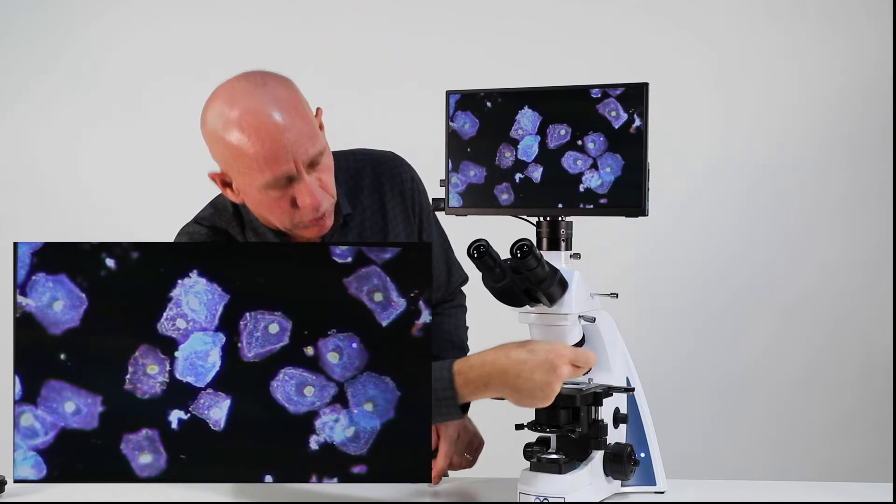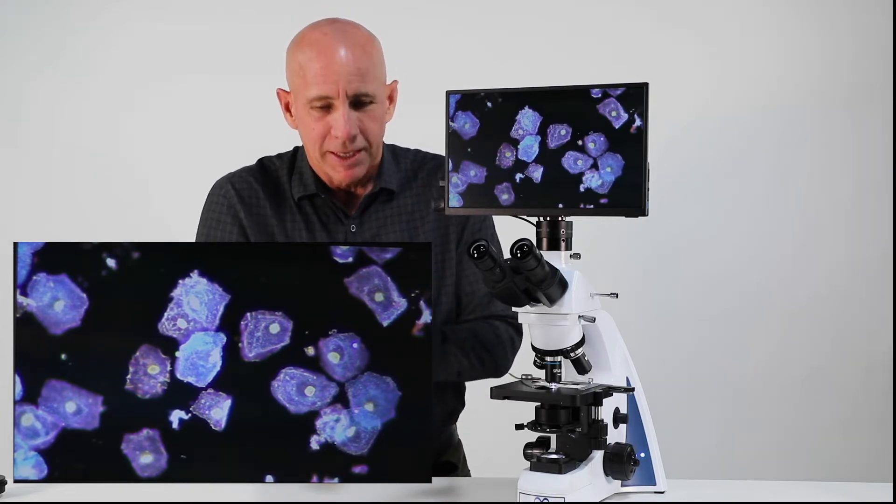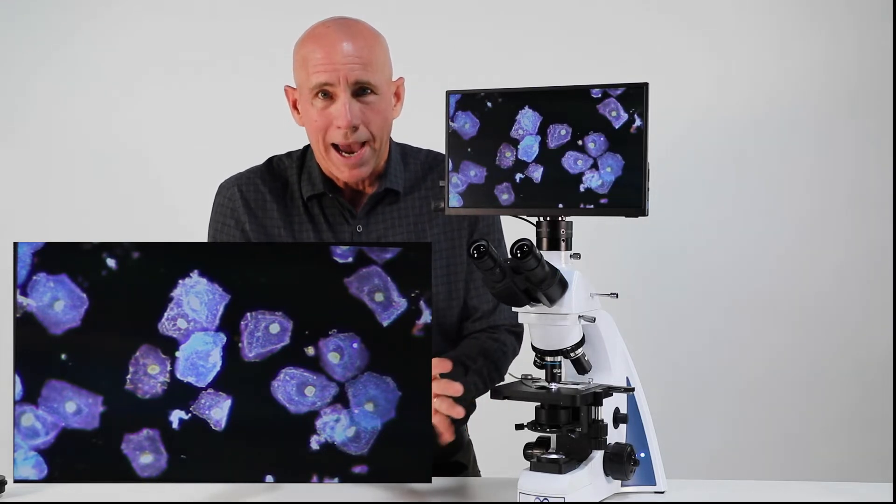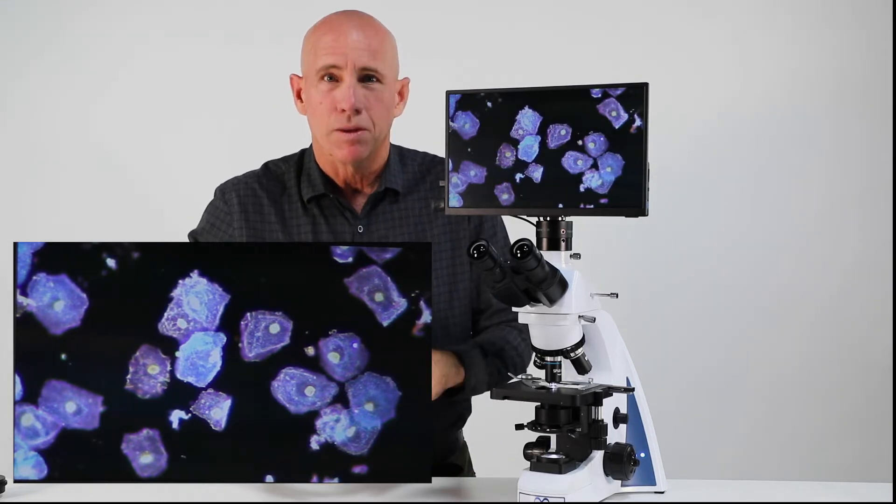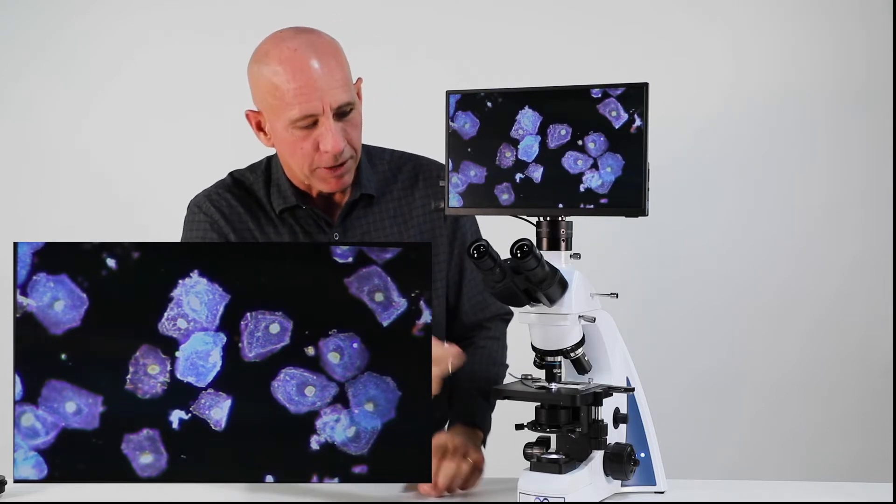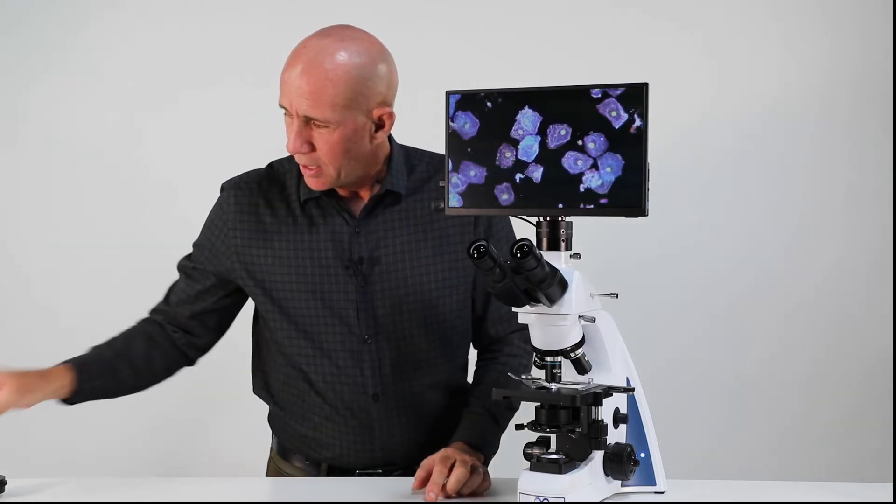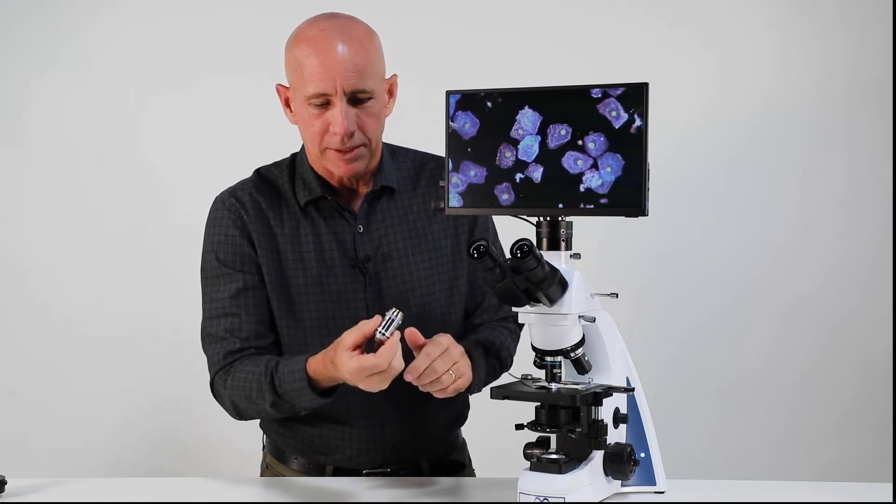That means when you go to your 100X oil, it's not going to work. It's going to be bright. Basically the aperture of the objective is so wide that it can still gather the light. Because what's happening here is it's blocking the middle of the light. And so it's dark in the middle.